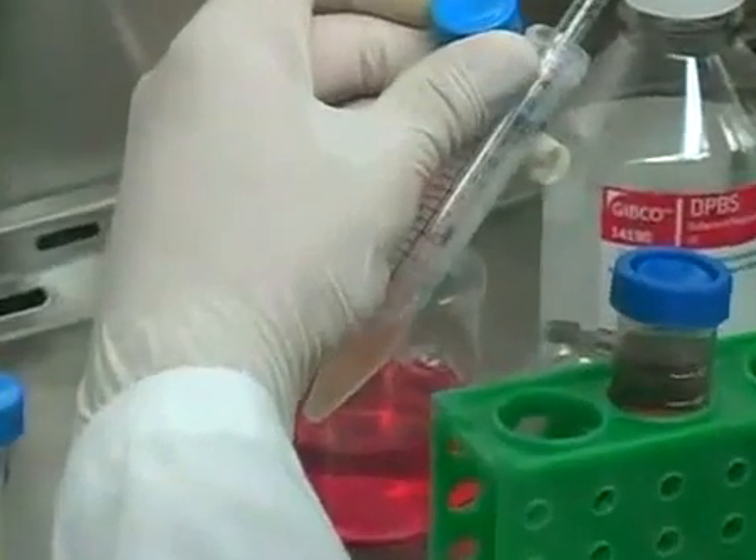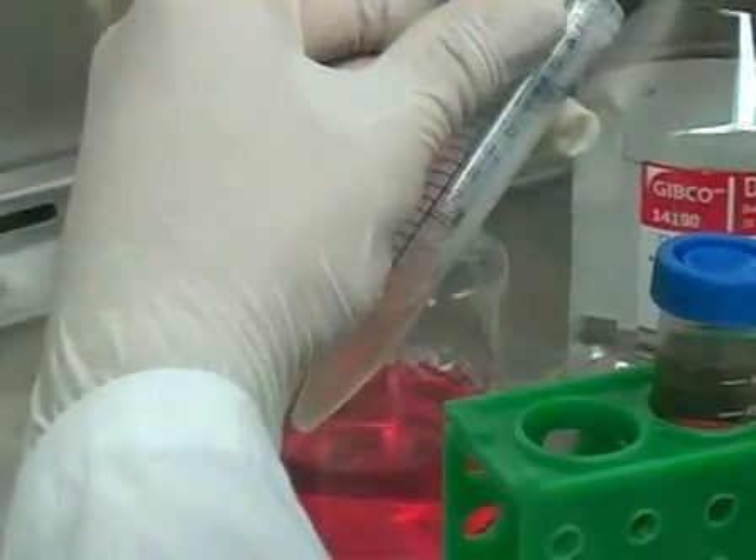Centrifuging the cell suspension and resuspending the cells in fresh medium and transferring the cell suspension into a new flask.